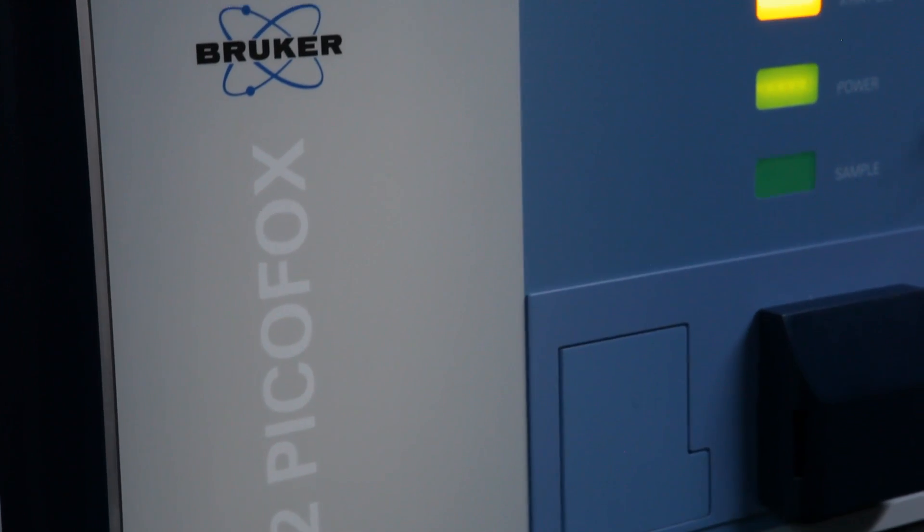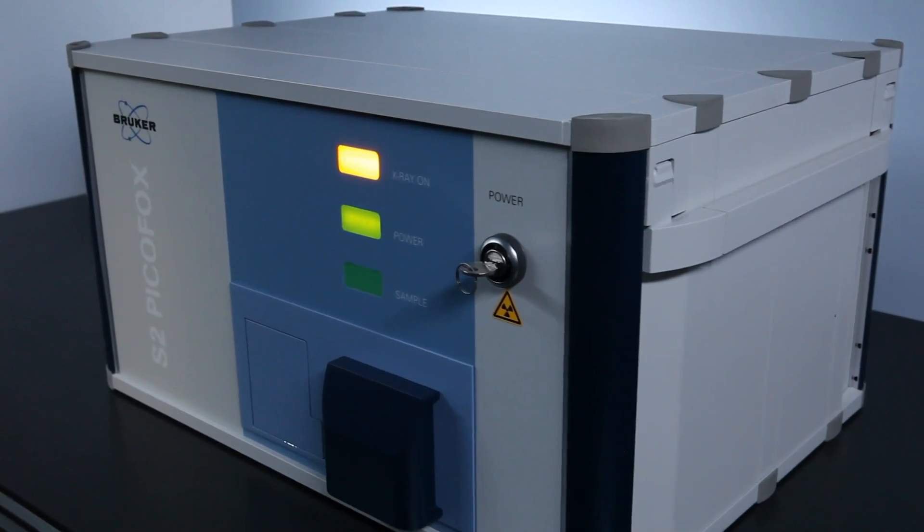The S2 PicoFox is both rugged and portable. In fact, many of our customers actually take the instrument to their samples. All that's required is 110 volts.